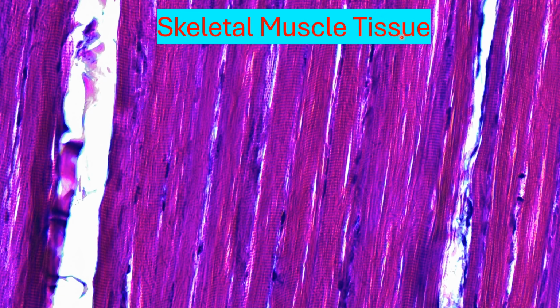So this one has a trichrome staining, so it looks a little bit unique, but overall we can see these long fibers running up and down. Perpendicular to that, we can see these striations. Note that the nuclei, they stain right here, and they are outside of the fibers. They might appear superimposed, but they are outside of them. We don't see clear beginnings or ends. Therefore, we have skeletal muscle tissue. Again, just look for the overall patterns regardless of the colors. Use that to aid you in determining the tissue type.